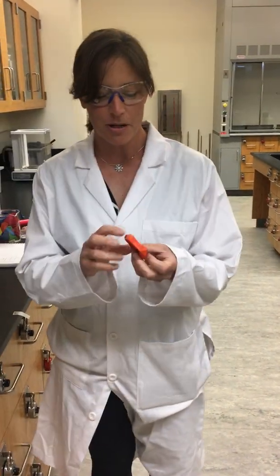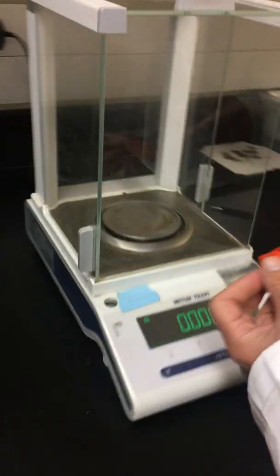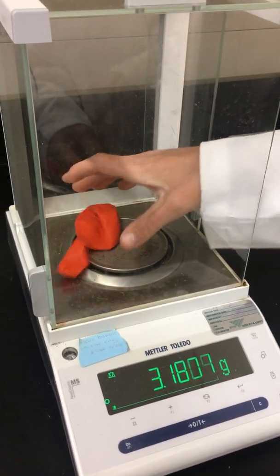Welcome back to the experiment — this is the last part where we're going to work with the gas. In this part, we're going to take the mass of an empty balloon, so we'll place our balloon on the balance and make sure it's sitting on the pan.